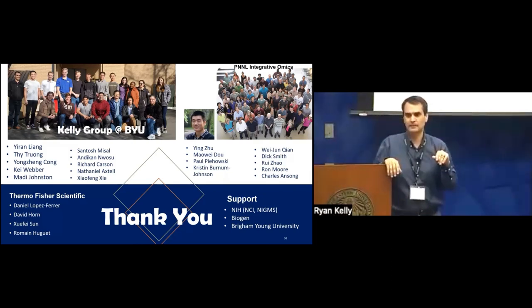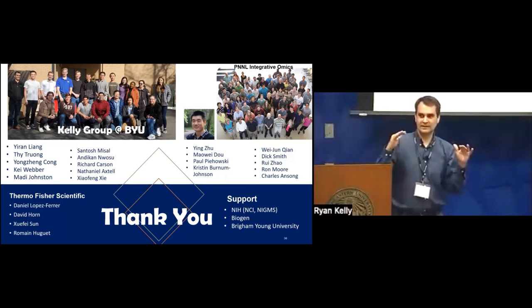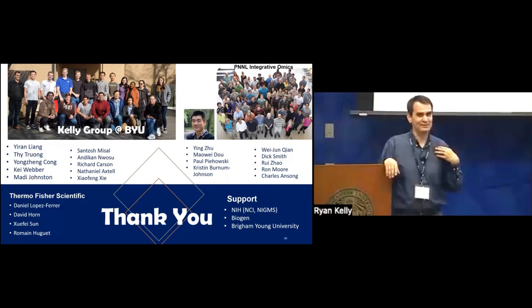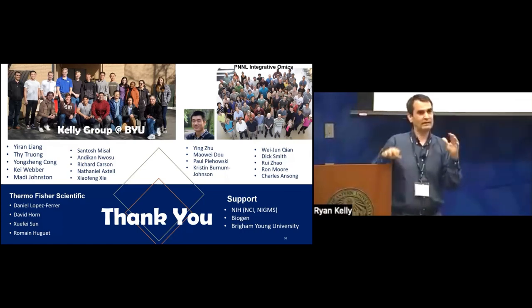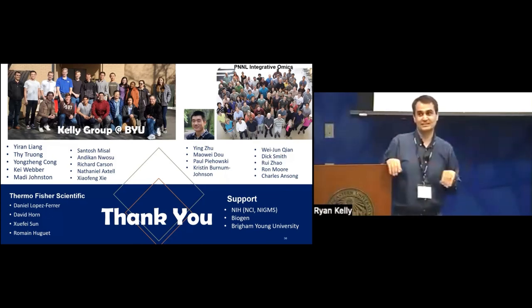Maybe plus or minus in terms of coverage, I would say minus 30 to 50%, something like that. And especially with sample prep, it would be awesome to have a lysate standard that we could compare different digestion methods with, but all of the commercial lysates out there are not clean, right? They have some SDS in here and this and that, so we can't use those. Just like we can analyze the exact same sample on the analytical side, it would be great to look at the exact same sample for the digestion side, but we don't have that.